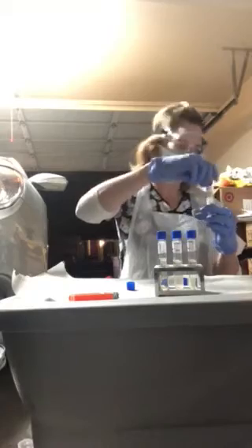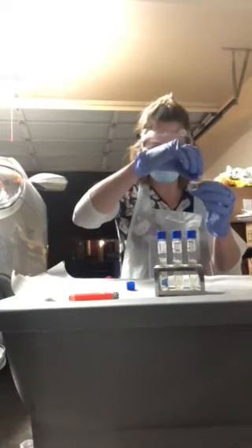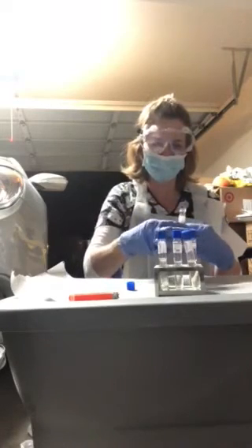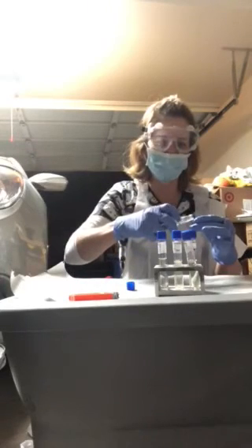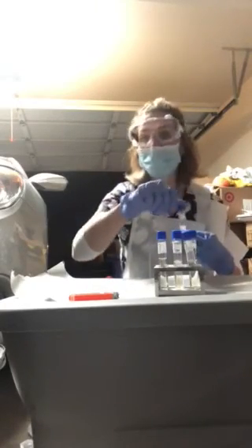I'll put the lid back on my S. cerevisiae and put it back in my other tray, sterilizing my caps and putting them back on. I have completed this first part of my lab. I'm going to return this to my growing spot and see what happens, then move right on to the second part of the lab.